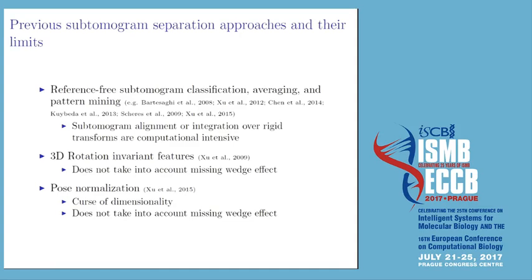Therefore, such approaches are only capable of processing tens of thousands of subtomograms using a computer cluster. So in order to increase the scalability, we also developed rotation-invariant feature and pose normalization approaches for the coarse separation of subtomograms. However, such approaches have limited accuracy because they do not take into account the missing data effect, and the pose normalization approach has a high dimensionality problem.